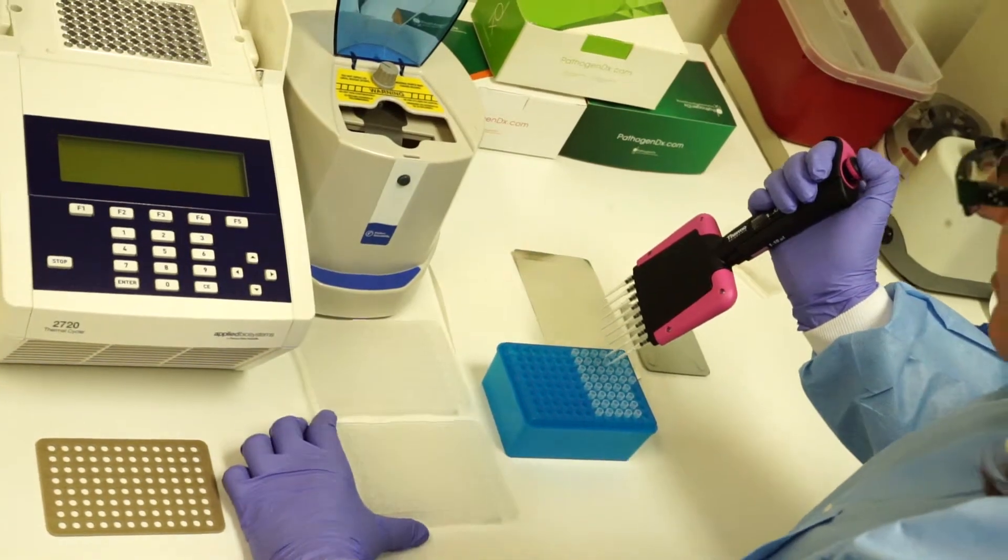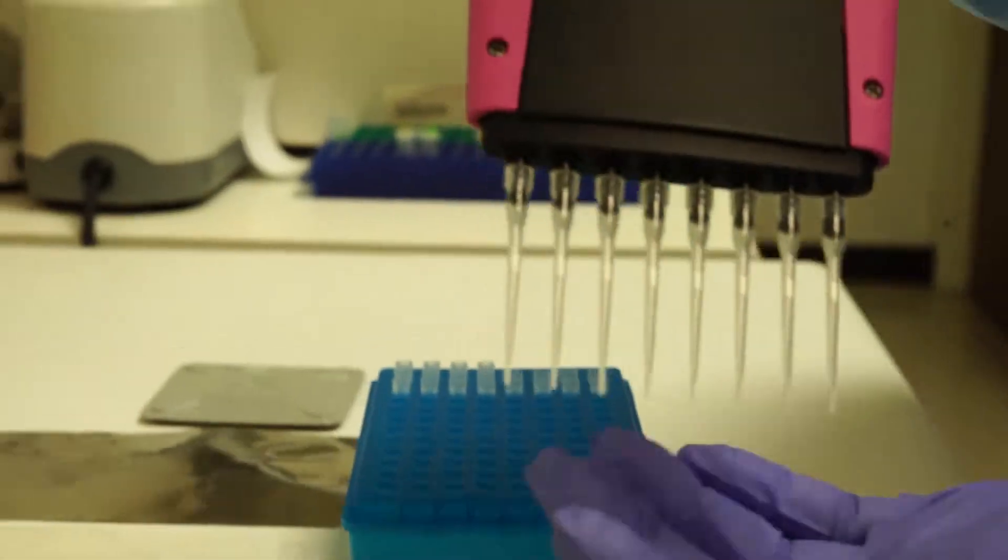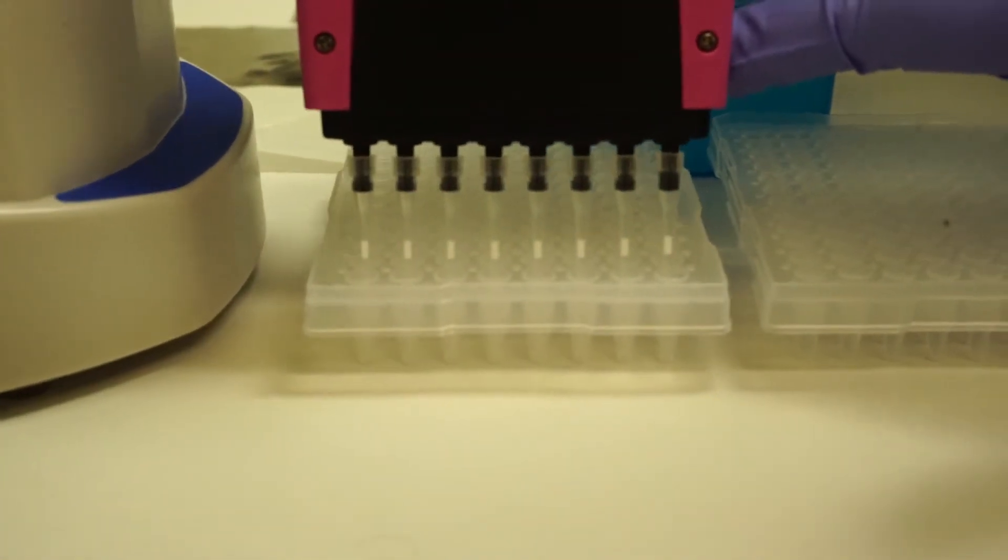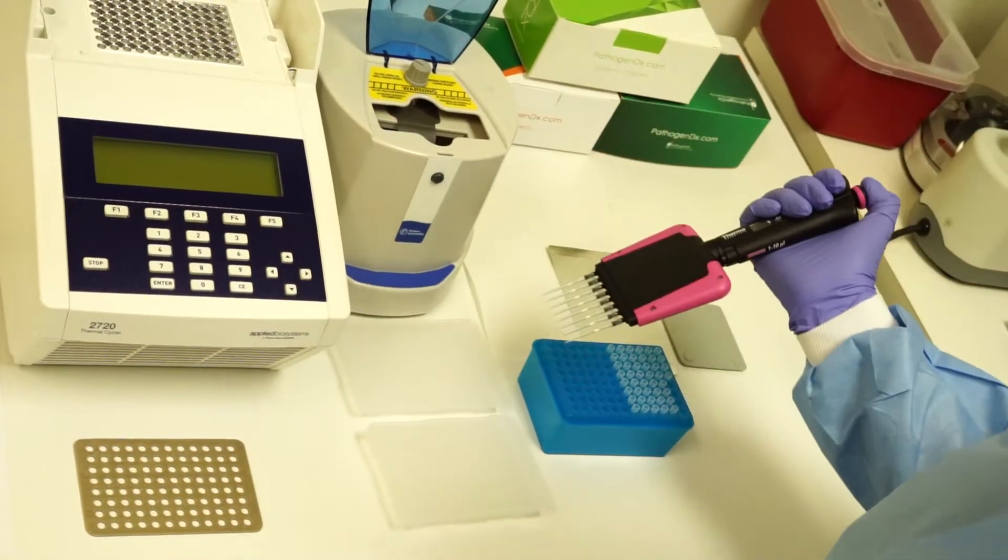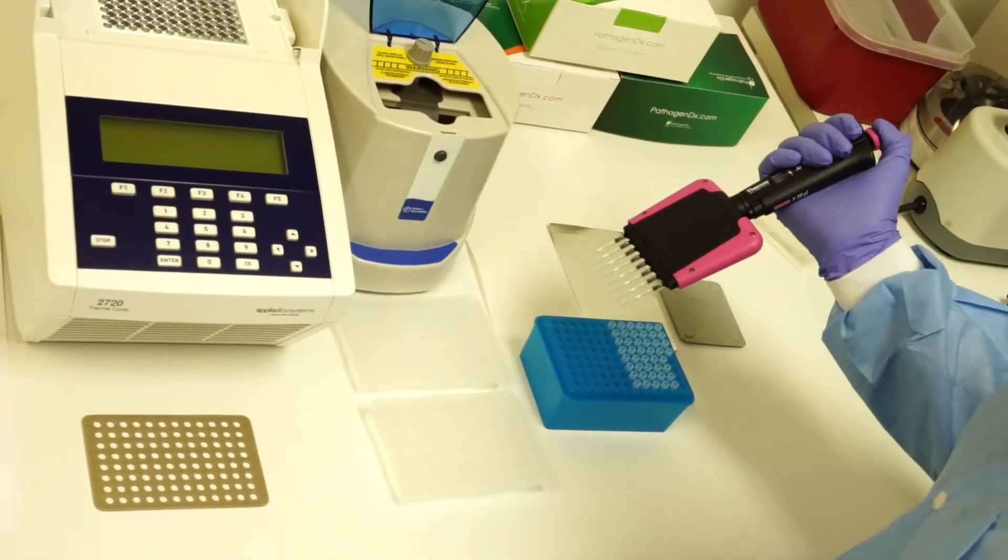Once the seal has been removed, pipette one microliter from the loci PCR plate directly into the labeling PCR well. Ensure that bacterial samples are added to bacterial samples and fungal samples are added to fungal samples to avoid any contamination issues.